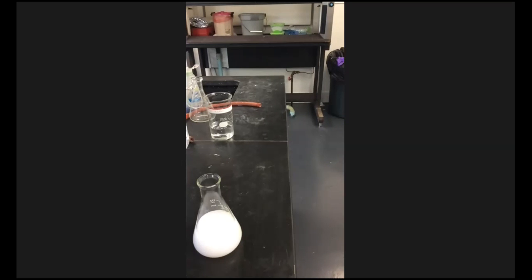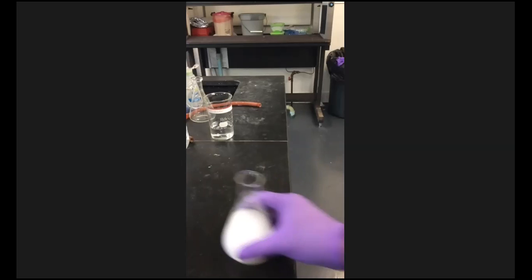The reason for that is that the final product, you want it to be a hydrate. You don't want it to be anhydrous. If you heat it over 100, then it's going to drive off all the water, and you're going to end up with an anhydrous salt, and you don't want that. You want it to be a hydrate, because the hydrate matches what's in the equation. We're good? All right. So it says to heat it.